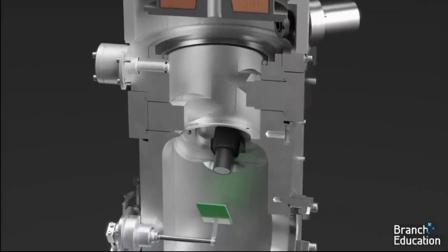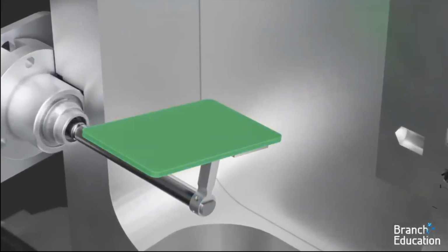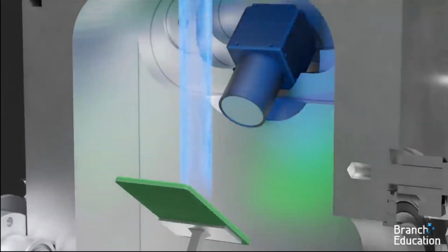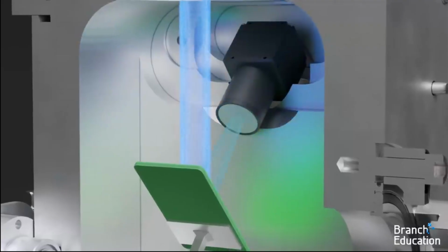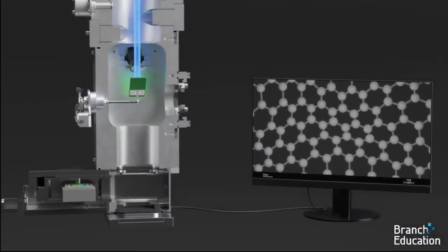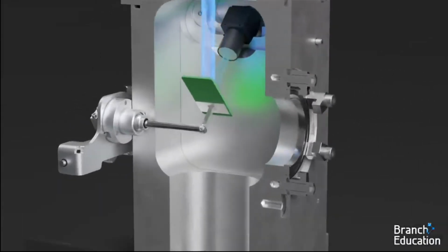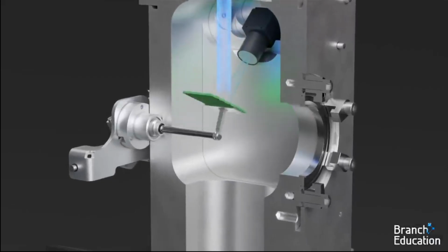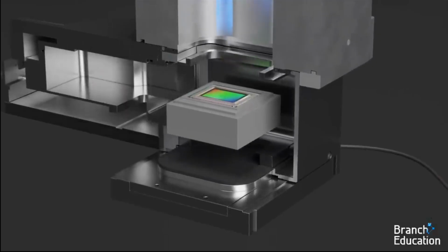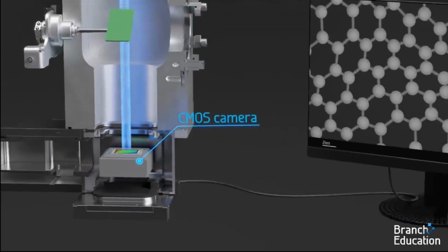There are two separate systems. First, we have a phosphorescent screen, which has a special coating that glows when electrons hit it, and a camera is used to view the screen. This system is used to align the microscope and provide an overview of the specimen. When you're ready to capture a high-resolution image, the phosphorescent screen moves out of the way, and the image is captured using the second system with a more sensitive CMOS camera that has a higher resolution and dynamic range.